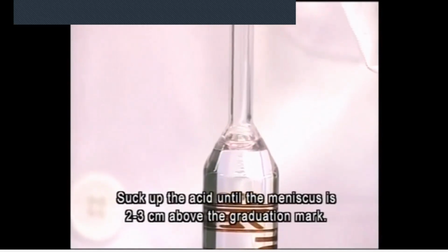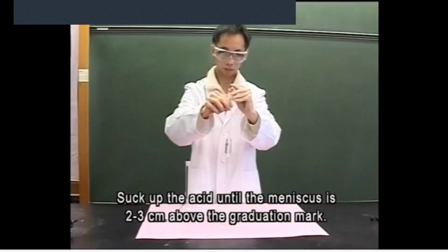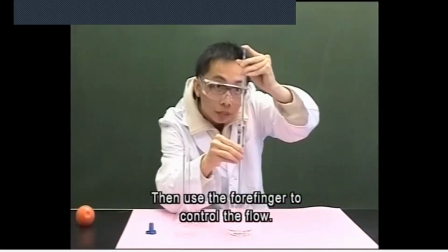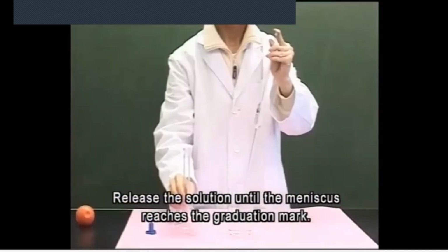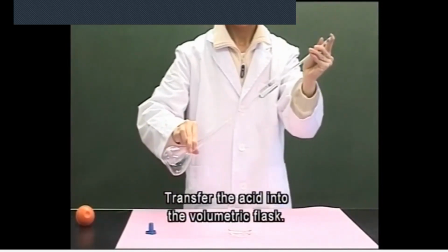Suck up the acid until the meniscus is 2 to 3 centimeters above the graduation mark. Then use the forefinger to control the flow. Release the solution until the meniscus reaches the graduation mark. Transfer the acid into the volumetric flask.